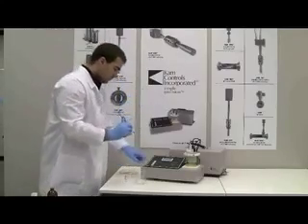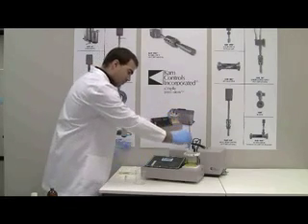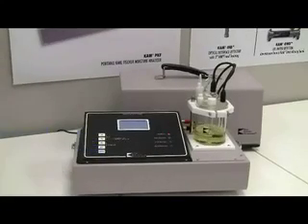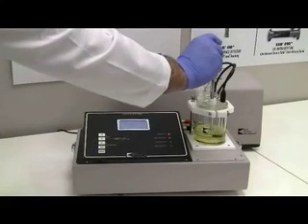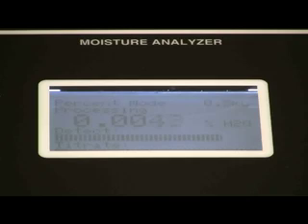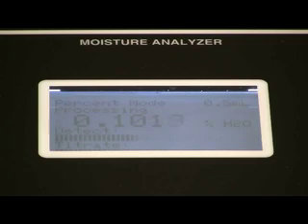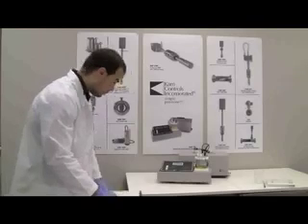To begin moisture analysis, press reset on the display. You have a 30 second window to inject the sample. Insert the tip of the needle into the sample injection port and make sure that the tip of the needle is submerged in the reagent. Then inject the sample into the reagent. Titration begins automatically. When it is done, the machine will beep and you may record the result.